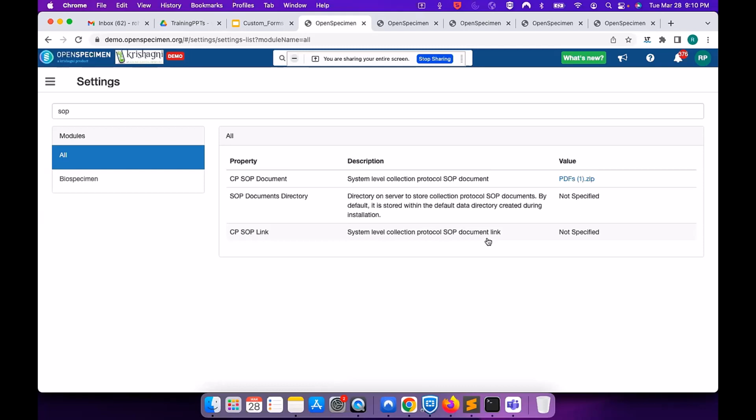I have another question regarding the labels. I don't think we have the answer for those yet. And we really need to have a way to get a PDF format so that we can print the labels in a laser printer. Yeah, we are discussing that internally. I have already raised that with my internal team, and I will get back to you as soon as I get any response. Okay, thank you.